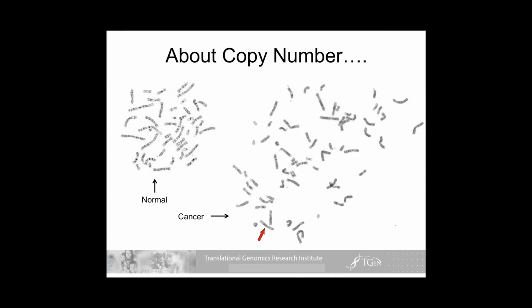But this is a translocation. What this has done, here's one normal chromosome 1. I don't see another one right obviously. This is how for this region of chromosome 1 you can all of a sudden go from saying, oh, the copy number is 2 to, oh, the copy number is 1.5. Because I can tell you that while this is a representative cell, this happens to be an adrenocortical carcinoma cell line.